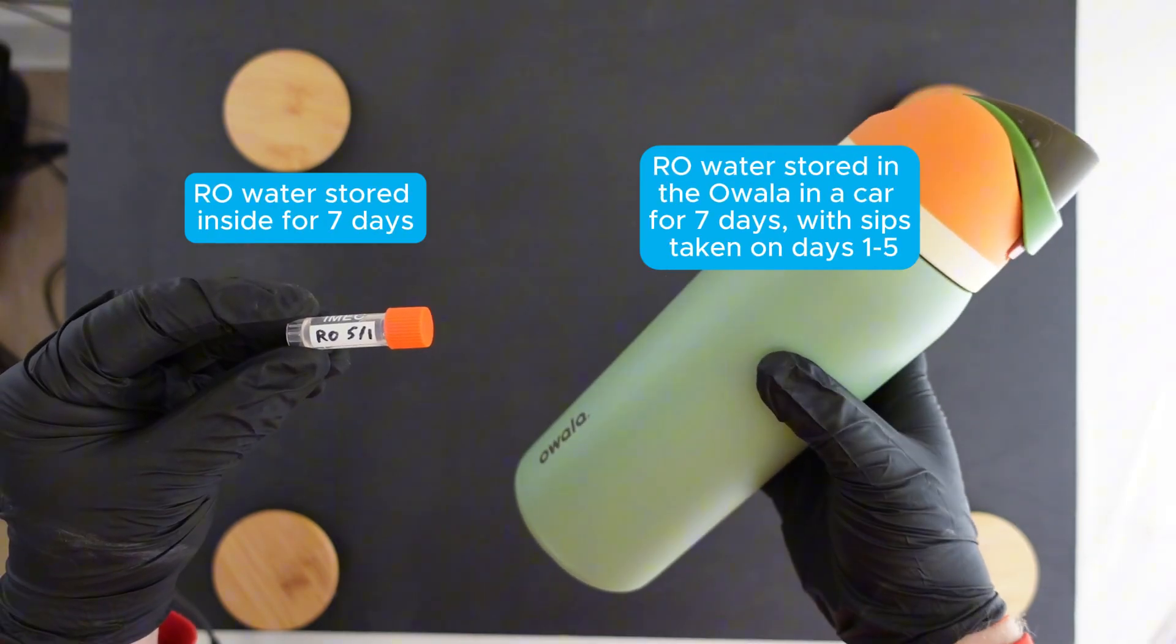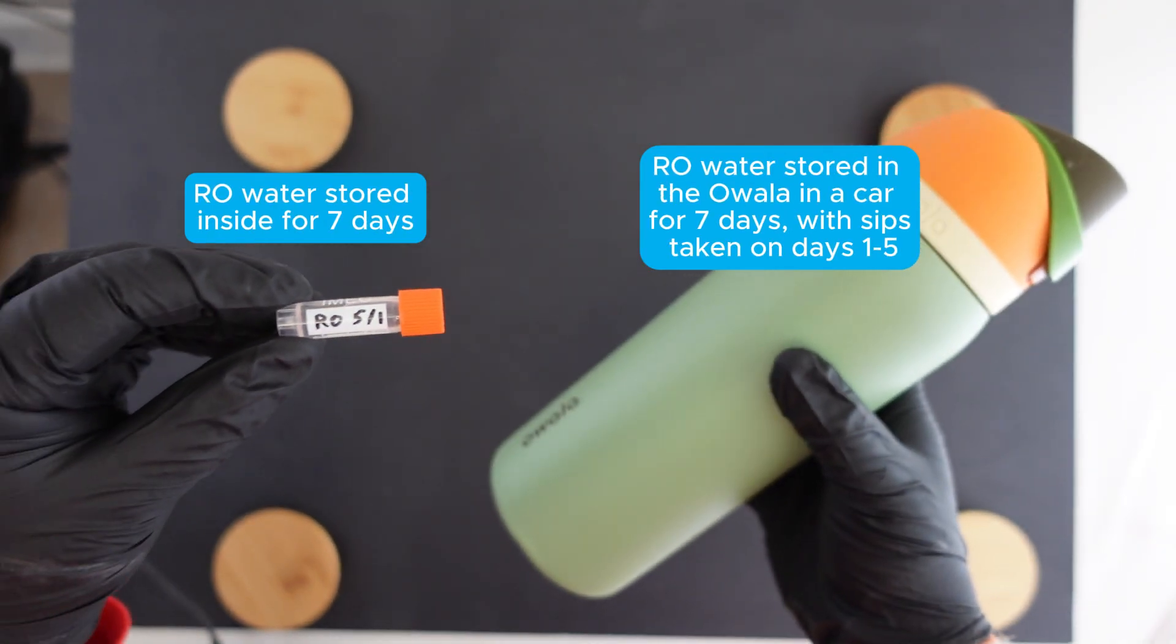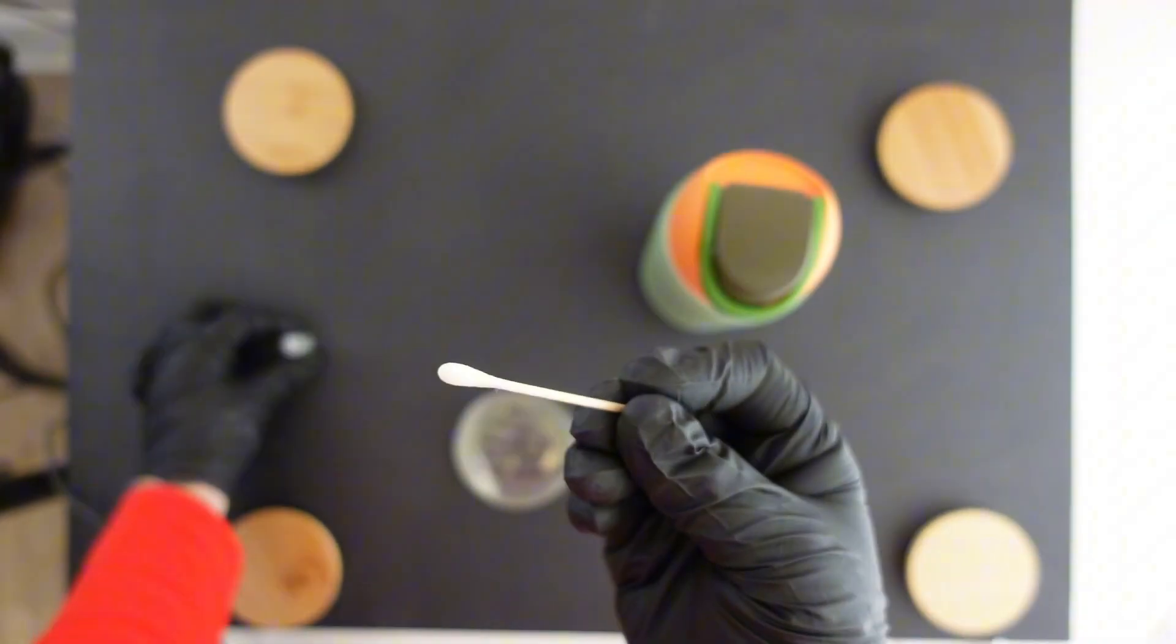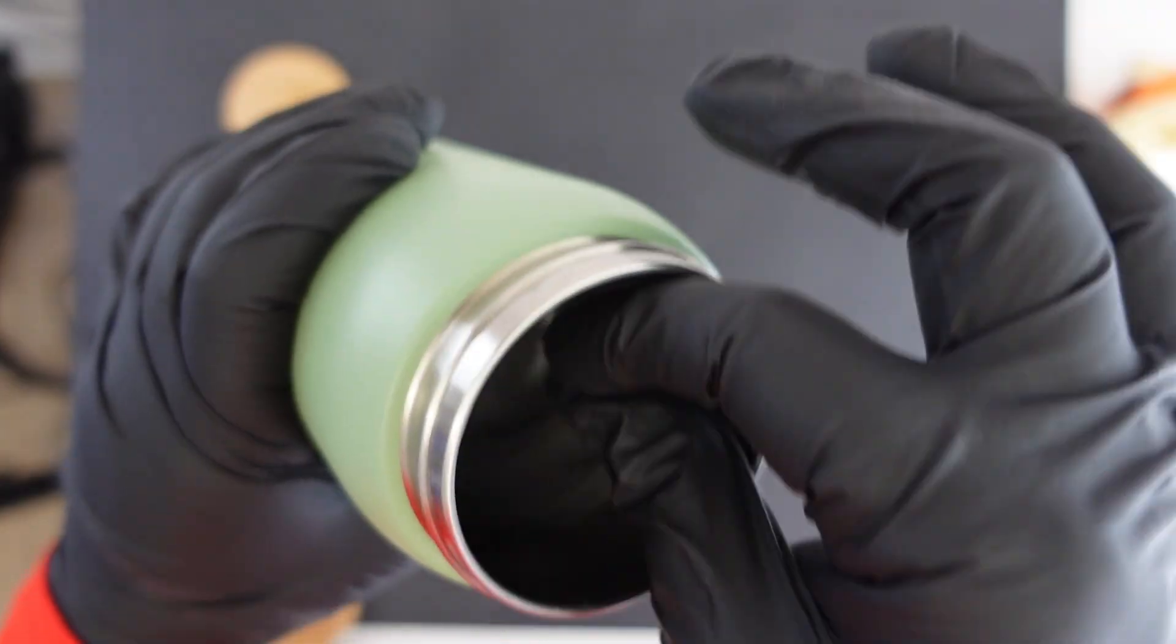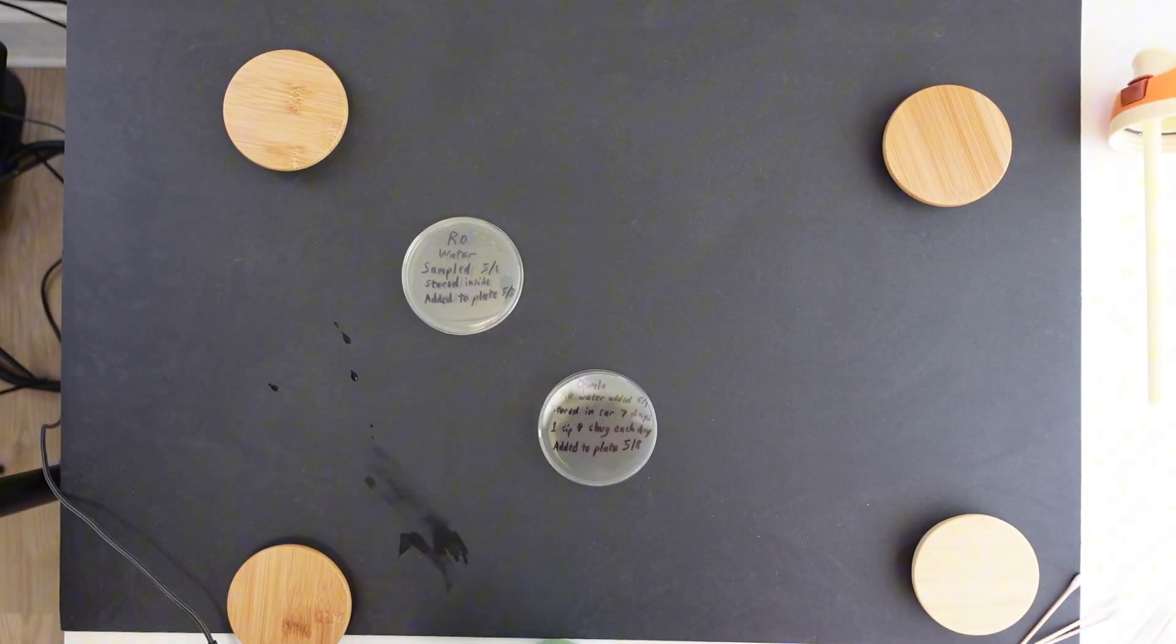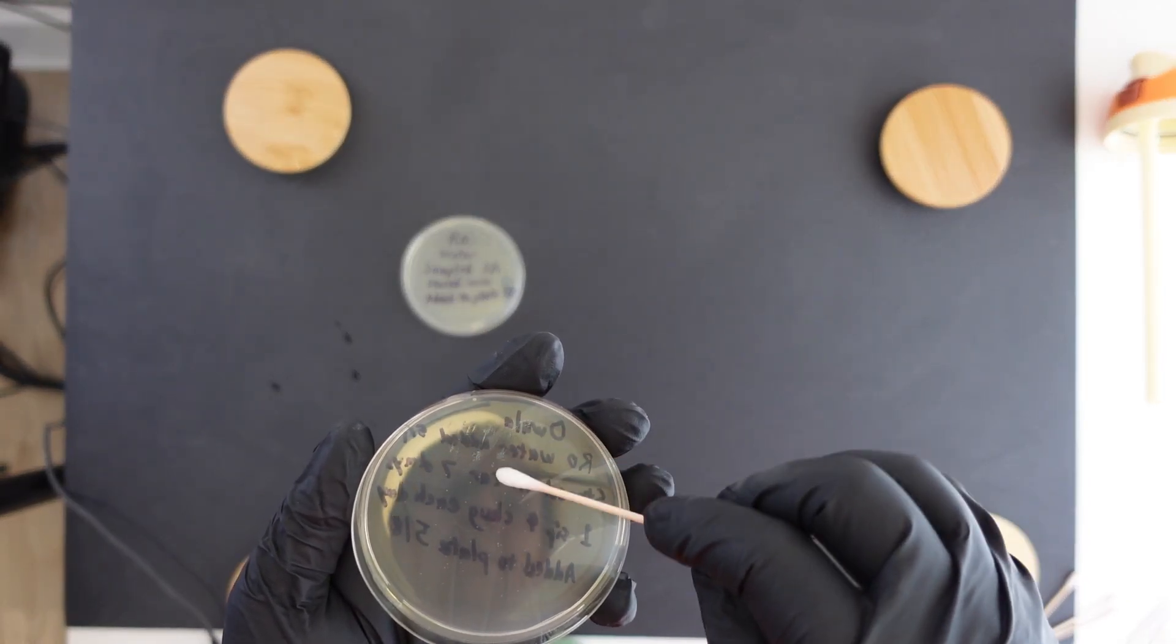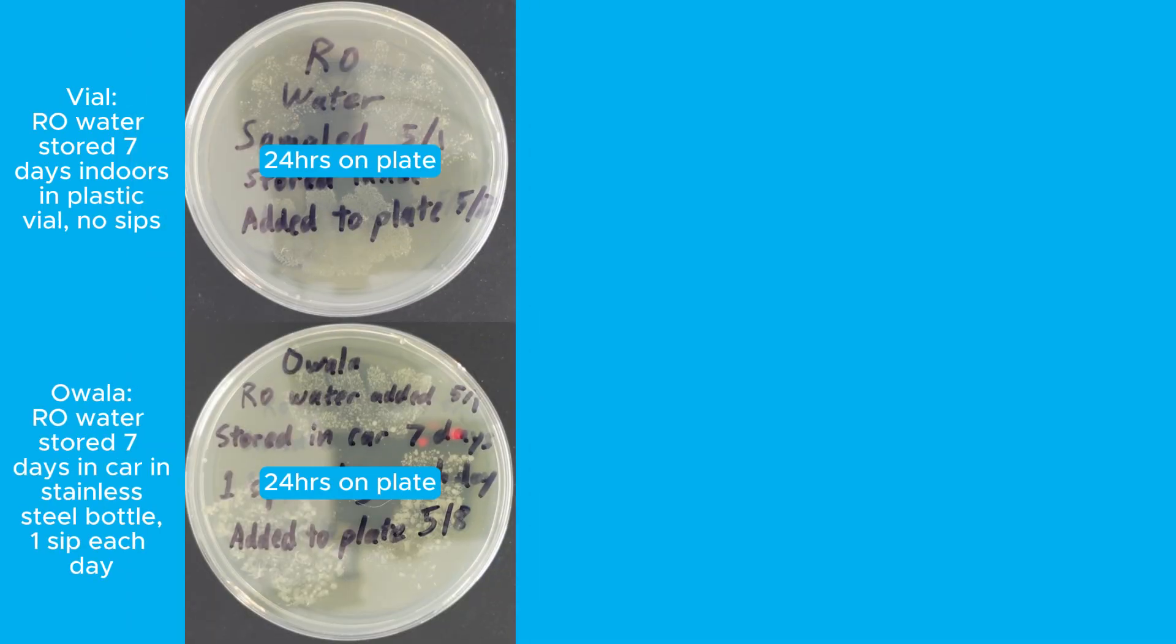Remember that little vial of fresh, clean RO water? I kept that stored indoors for seven days, then sampled it on this petri dish. Then I dipped swabs in the Owalla, which had been in the car for seven days, and put that on this other petri dish. Here are the results from each one after one day in the incubator. Even though the RO water is very pure, some bacteria grew on that petri dish because it's difficult to completely avoid bacteria with this kind of setup. But there was clearly more starting bacteria from the Owalla sample, and you can see how that led to a lot more growth and larger colonies.